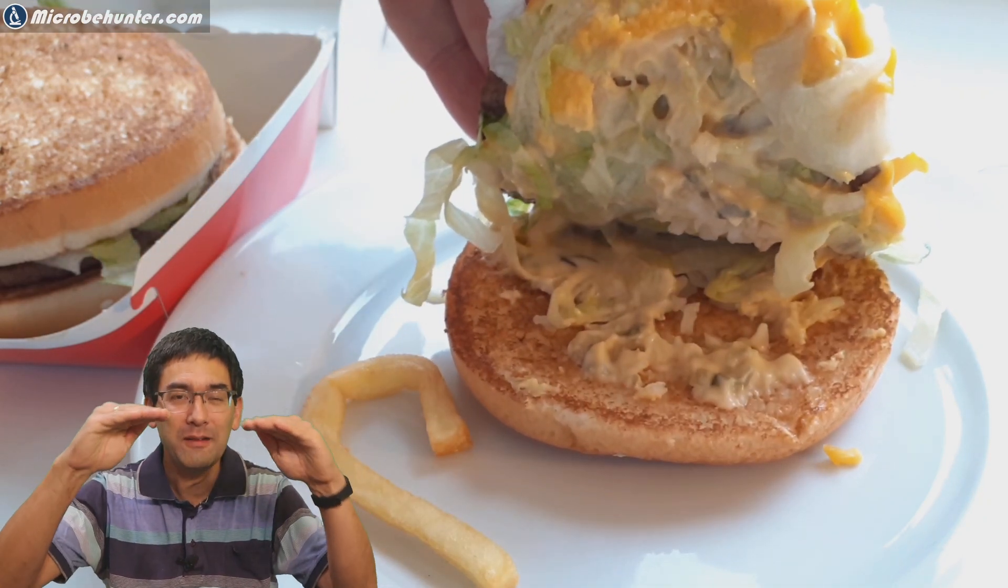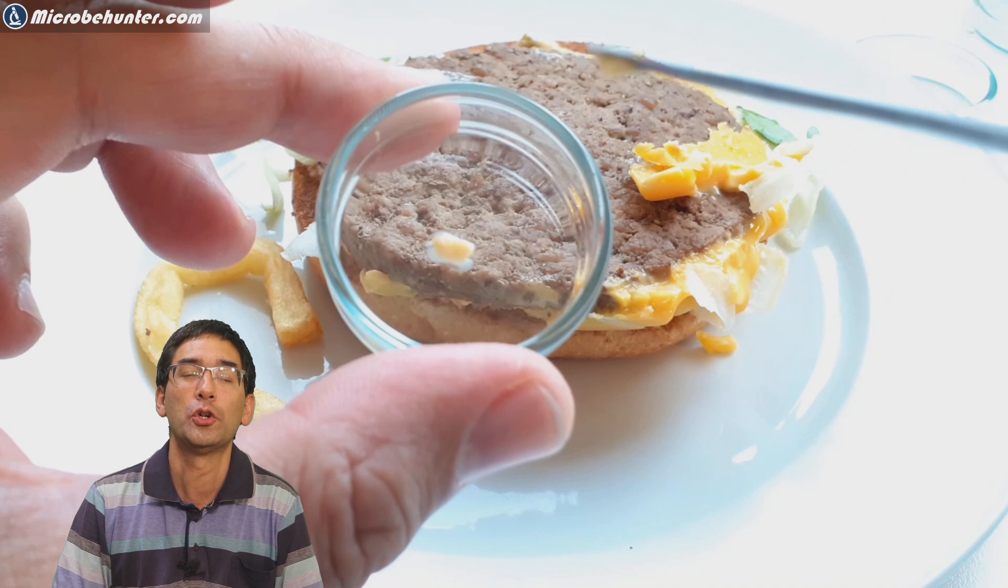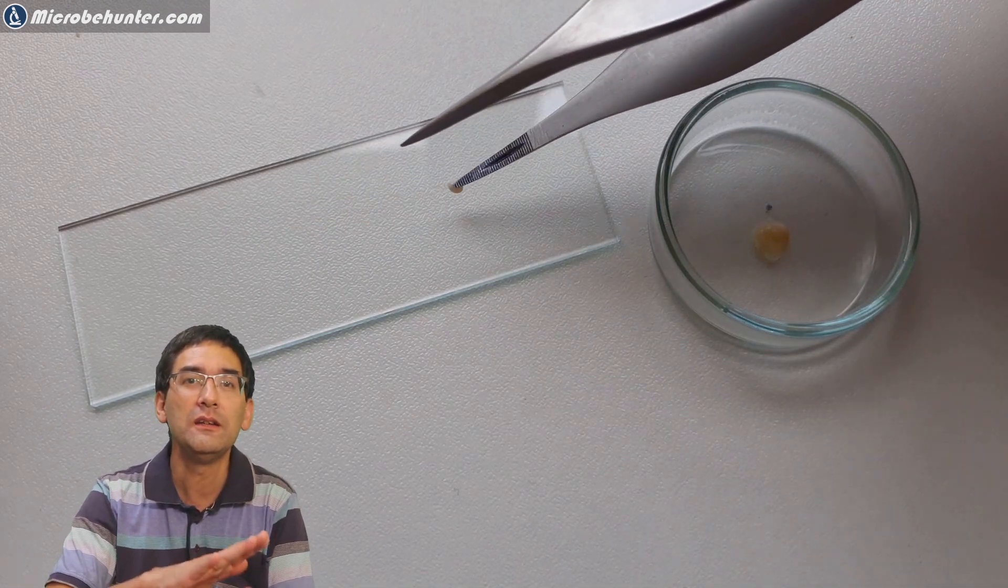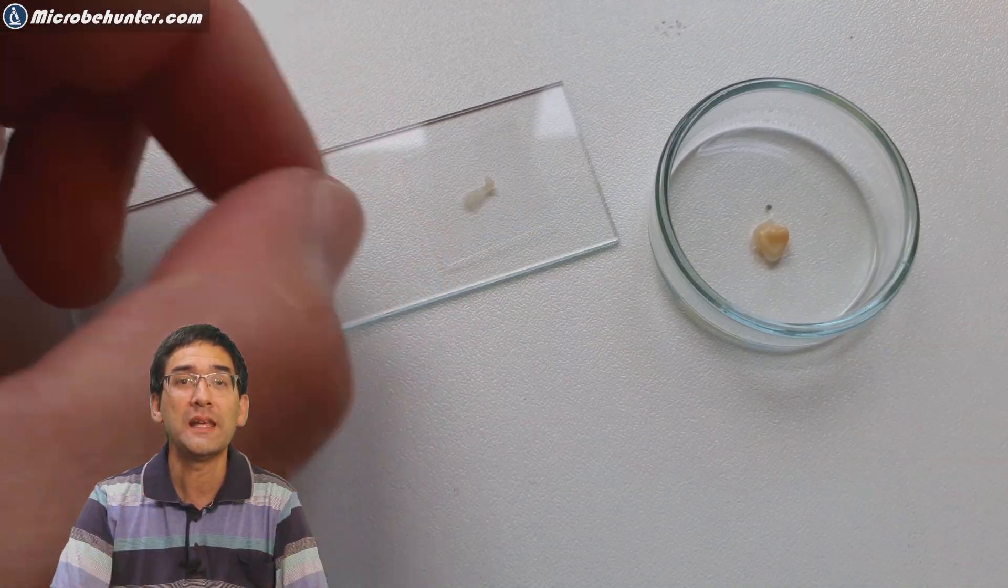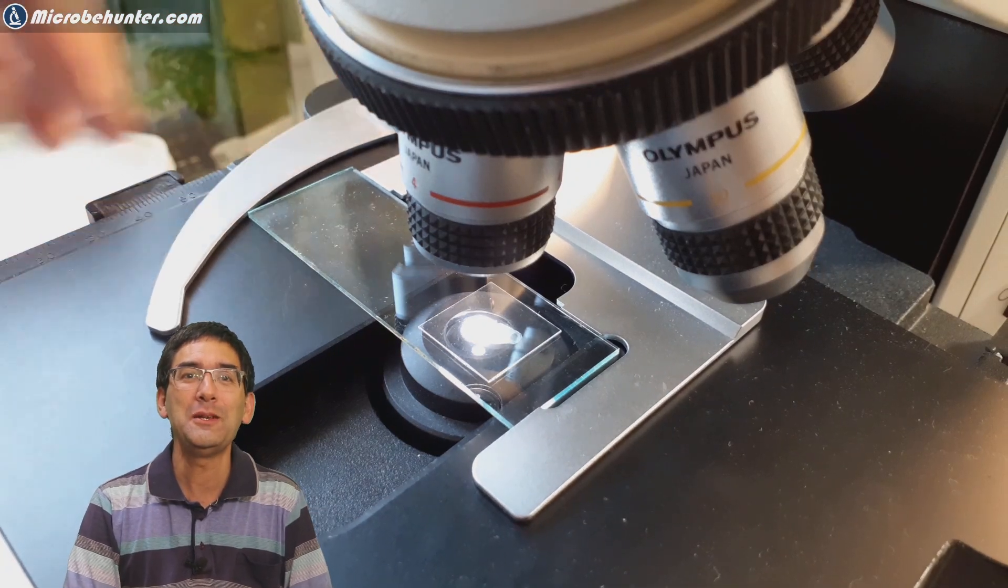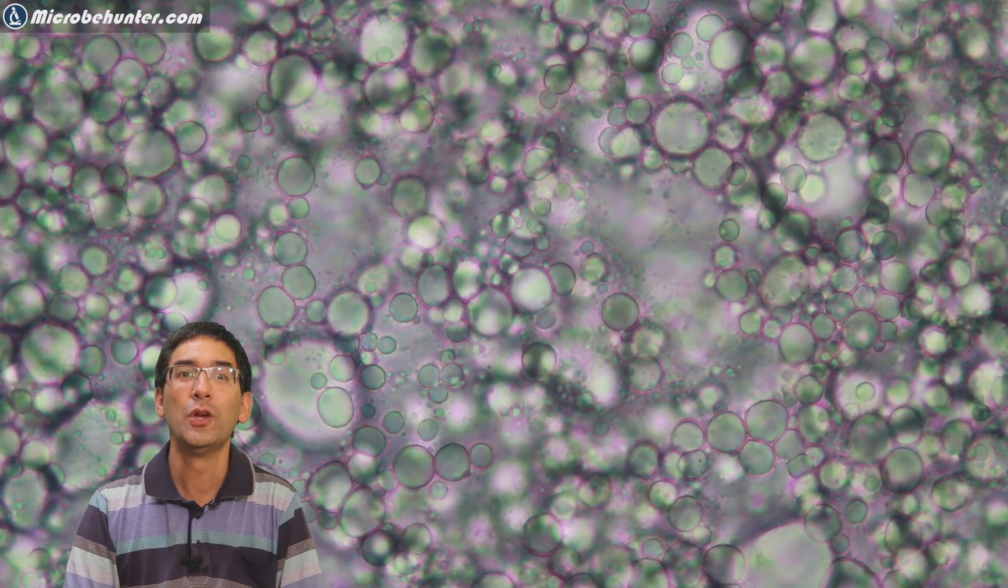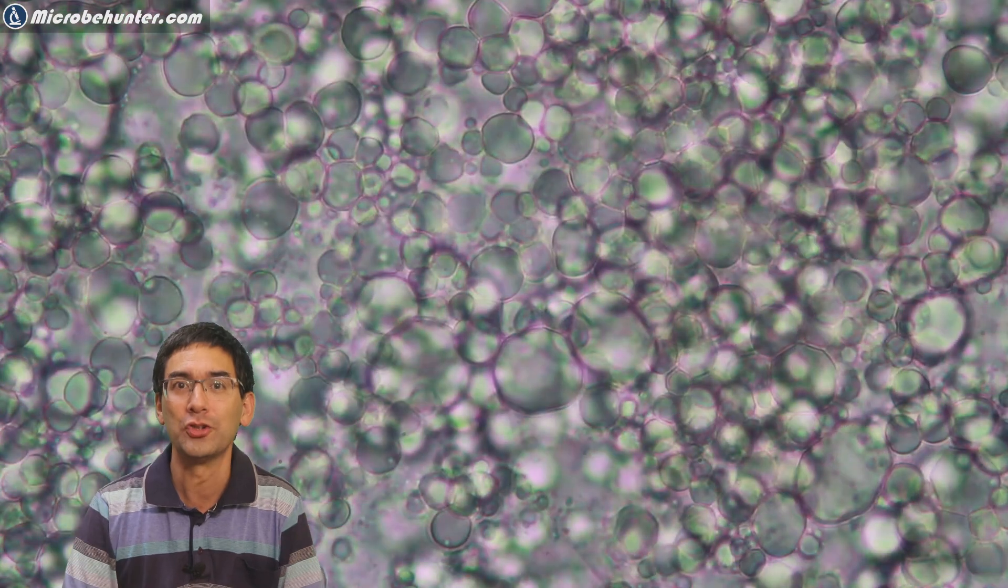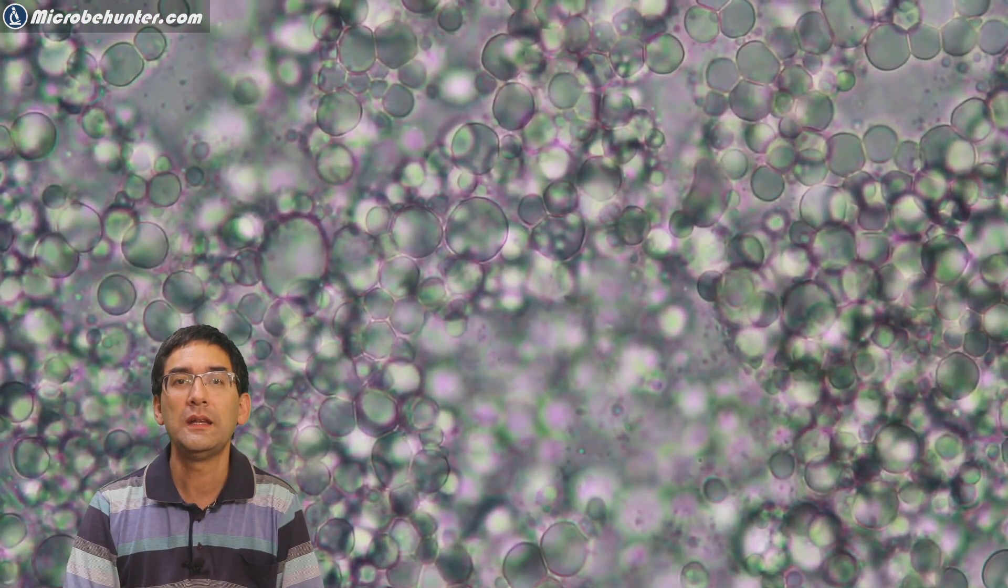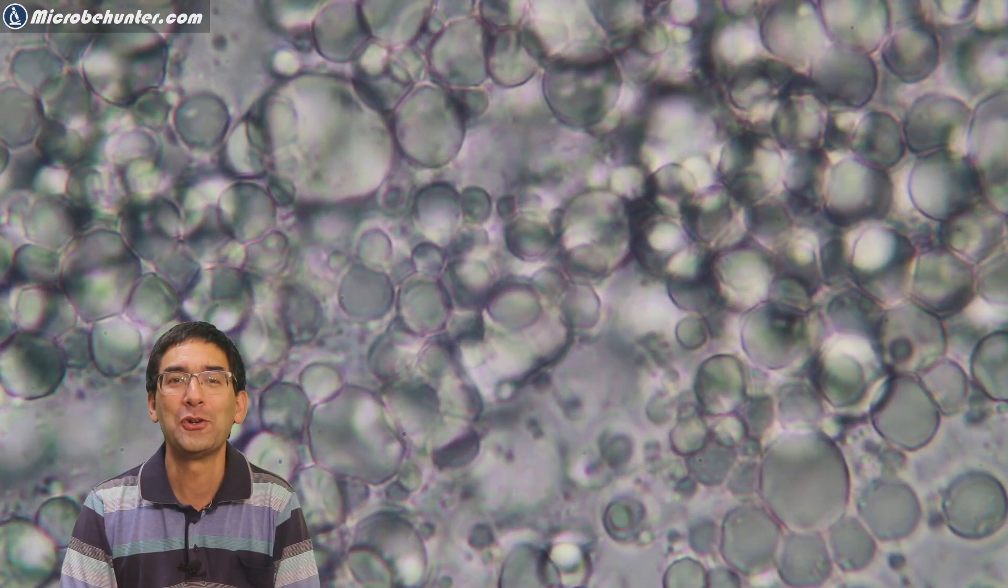Finally I worked myself layer by layer downwards, and on the very bottom I did finally find the hamburger sauce. This one was quite easy to observe because it's very soft and almost liquid. Therefore it's easy to press it into a very thin layer. The shapes that I expect are probably going to be quite clear and transparent. I was actually hoping for that, and luckily I was not disappointed. I could see, as expected, that the sauce, the hamburger sauce, is an emulsion. Again we see those round structures which are fat droplets suspended in water. It's an emulsion, just like many creams are.